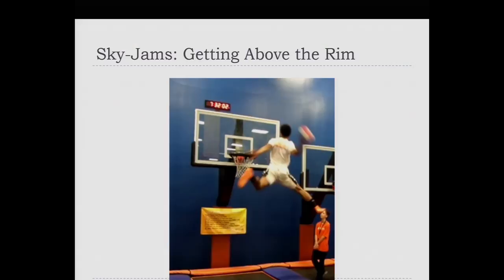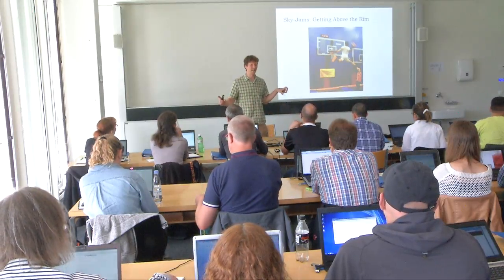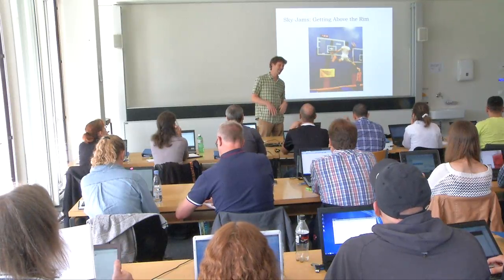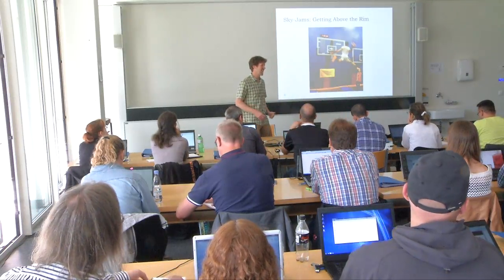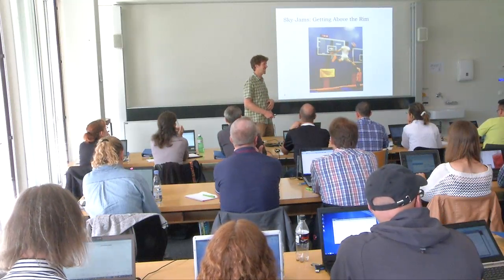So, what is a Skyjam? It's something that I came up with at the course at the University of Washington. I looked at the schedule and I went, there's not enough Skyline on the schedule. And so I started these Skyjams at 8 a.m. in the morning. So at the UW course at least, you had to be really dedicated to even attend a Skyjam. You had to wake up and be at the class at 8 o'clock in the morning.